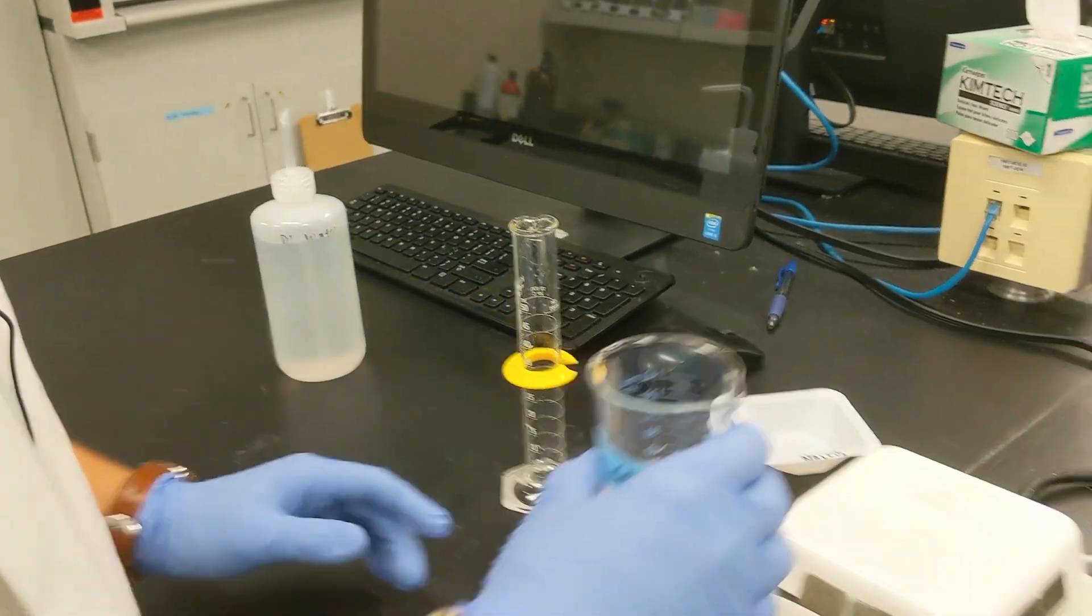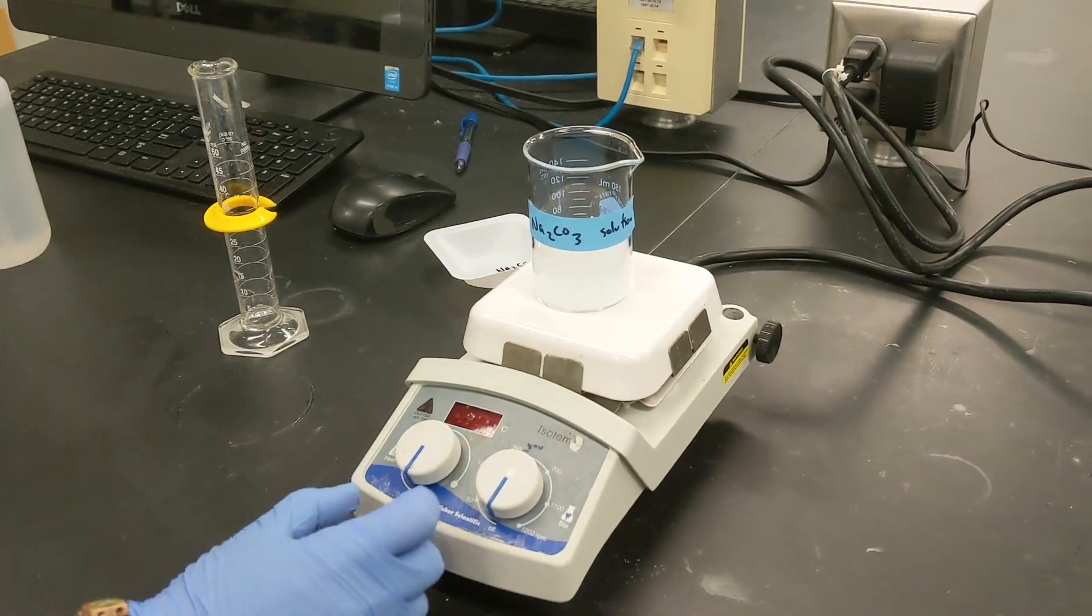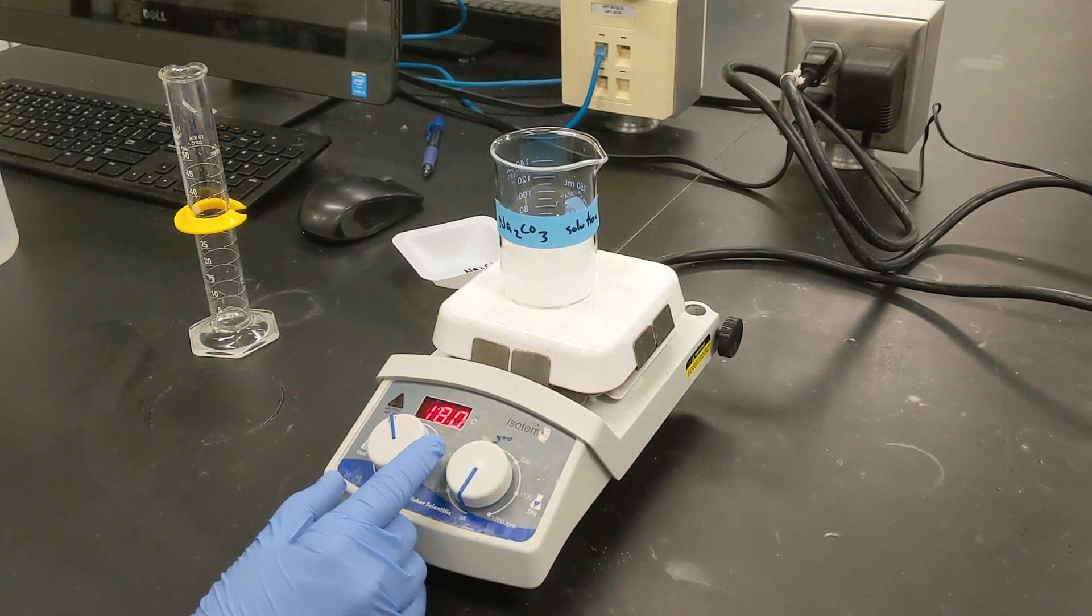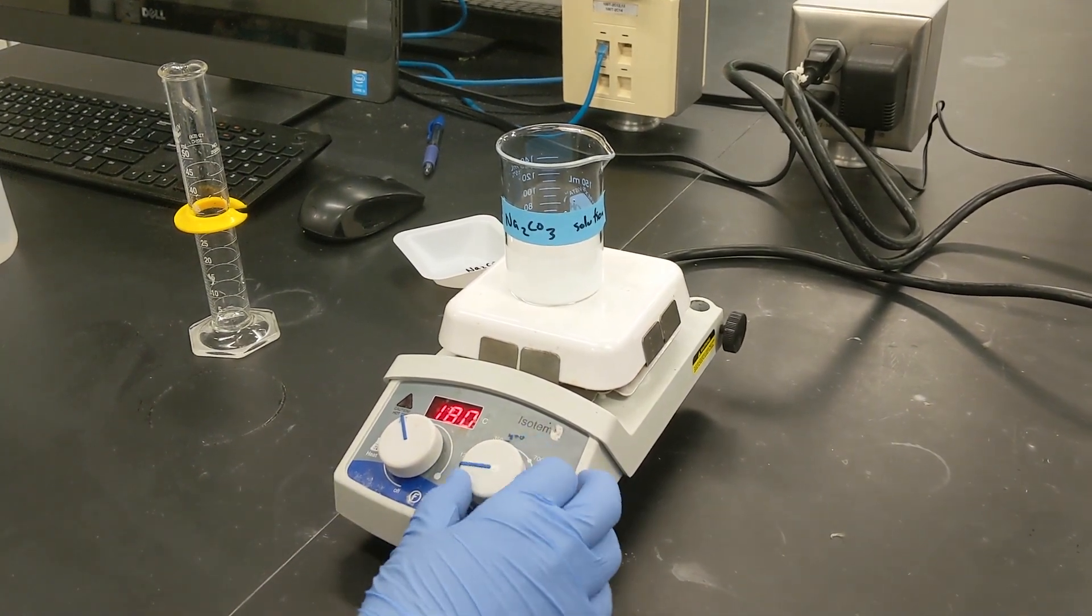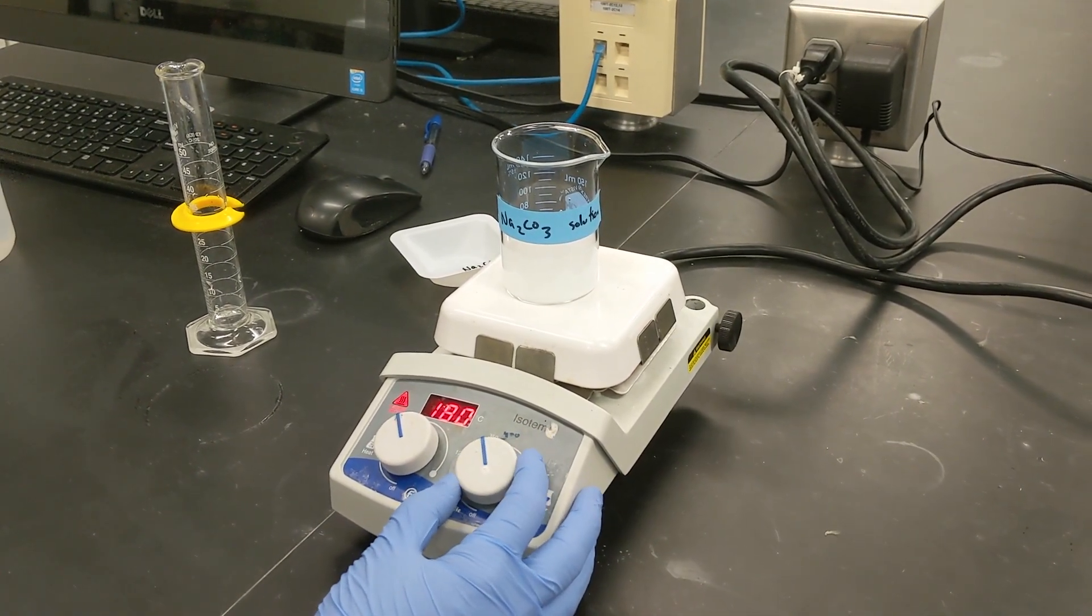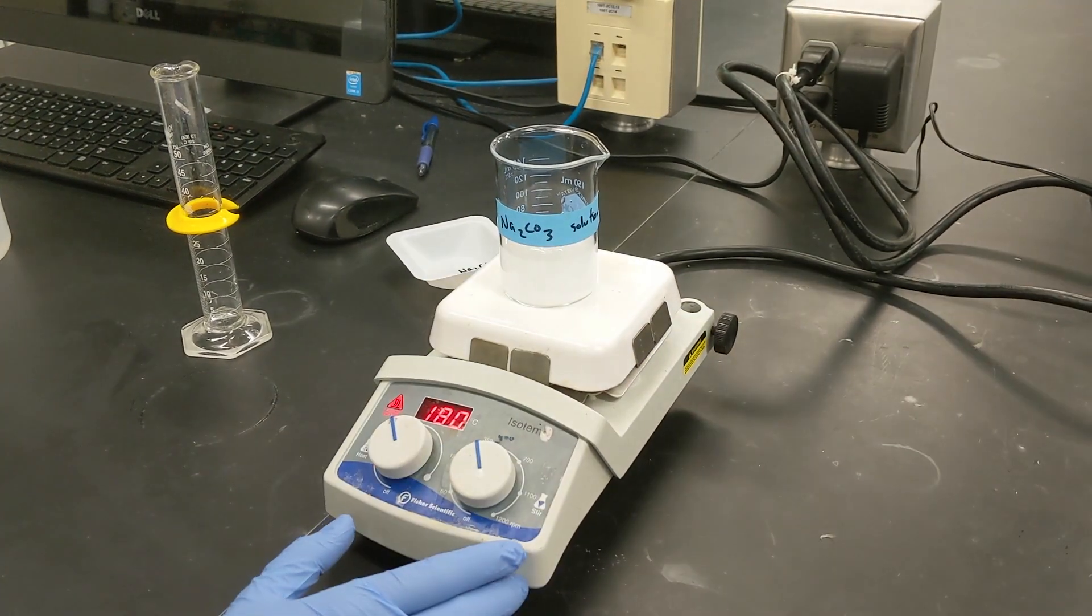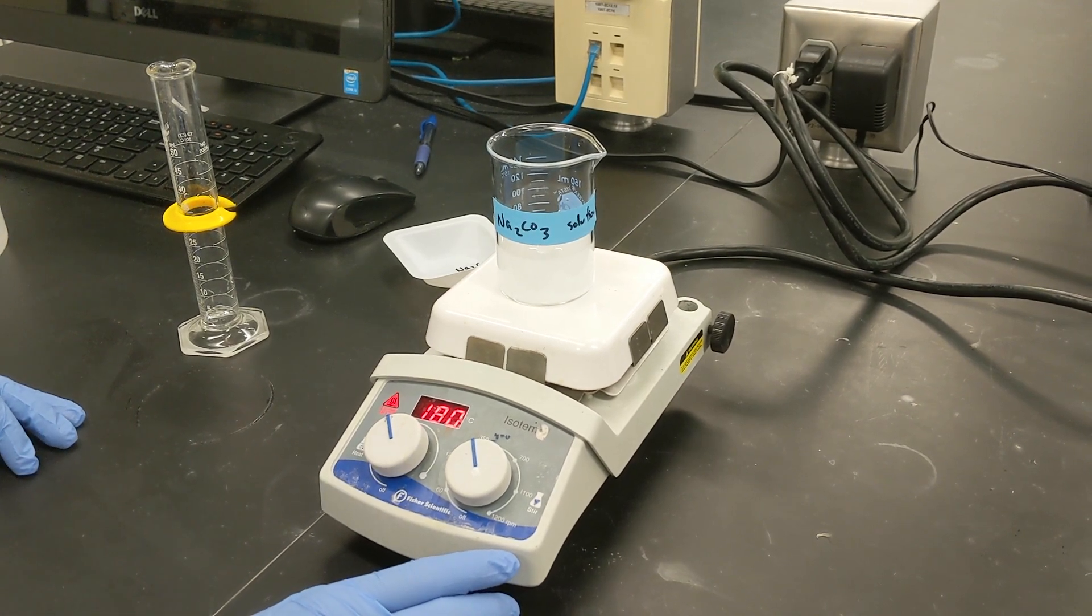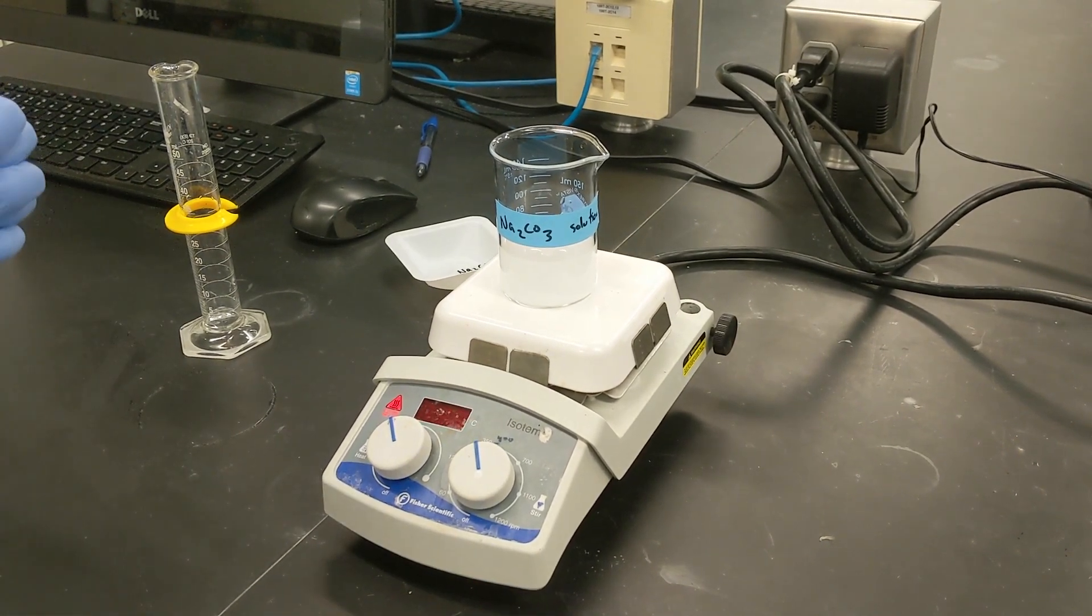There's a stir bar in there and so now what we're going to do is add this to the hot plate. We're going to turn up the heat a little bit, kind of keep it on low heat, and then we're going to turn on the stirring part of this stir plate and get it stirring and we'll wait for it until it is completely in solution.